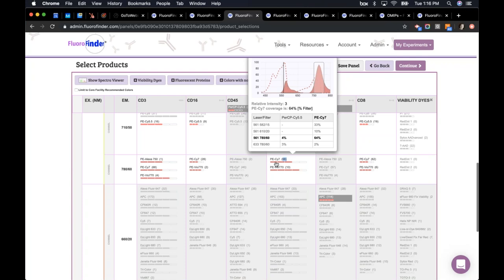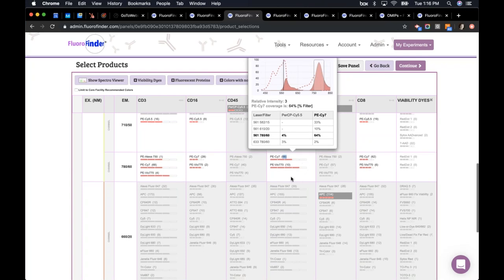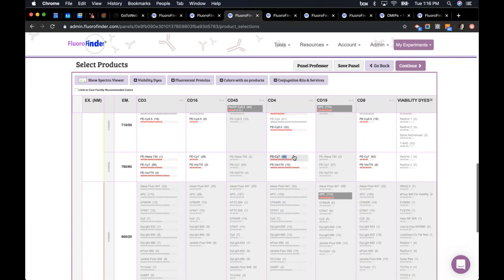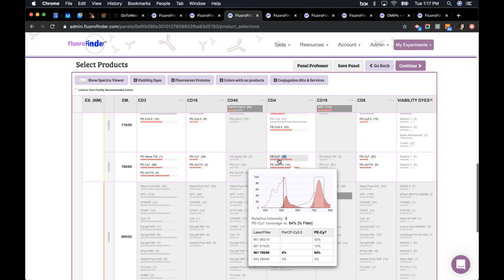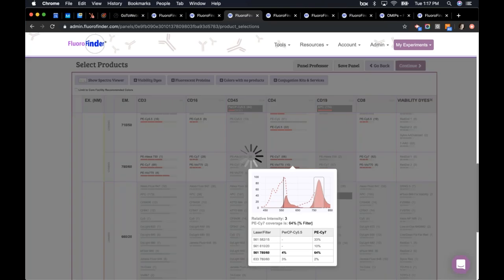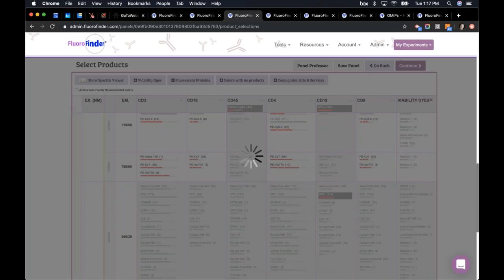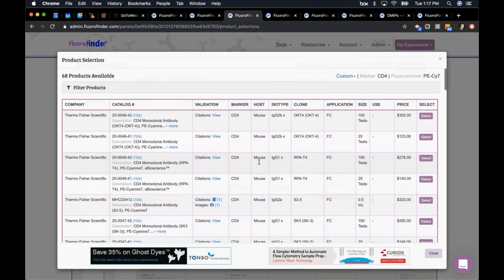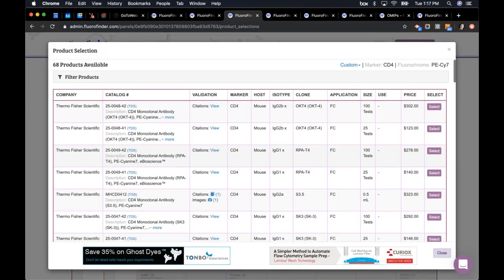That's one of the tools in FloraFinder that we think is helpful for selecting fluorochromes. Next to PE-Cy7, there's a little '68' in parentheses, telling me there are 68 commercially available CD4 PE-Cy7 products. If I click on that, up pops a list of those 68 products, broken down by vendor. The order of these vendors will be random — Thermo, Tonbo, BD — and it changes each time.